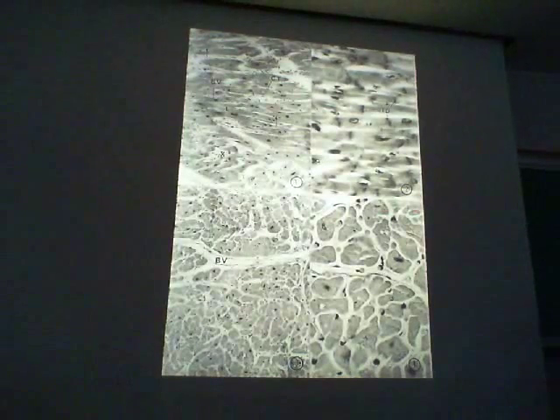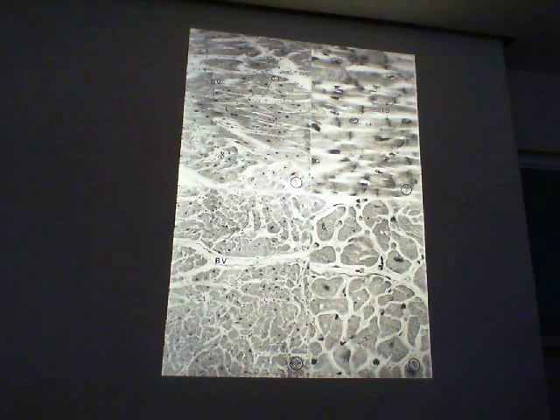Okay, this tissue. What is this tissue? Cardiac muscle. What's that structure right there? Intercalated disc. And how about this tissue? What is this? Cardiac muscle in cross-section. See the intercalated disc there, and those nuclei are centrally located, as you can see right there. And it still has that kind of pebbly looking appearance in cross-section, as does skeletal muscle. And that layer that we see right around that is what? Endomysium.